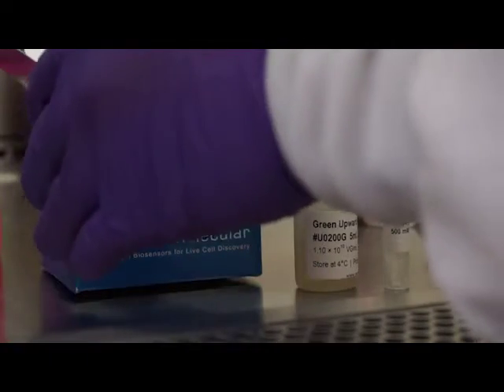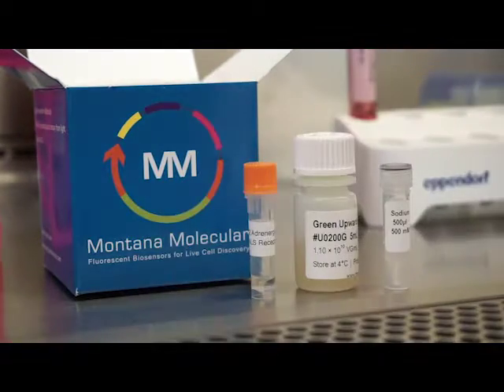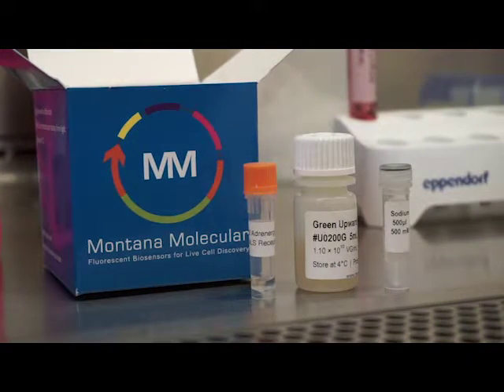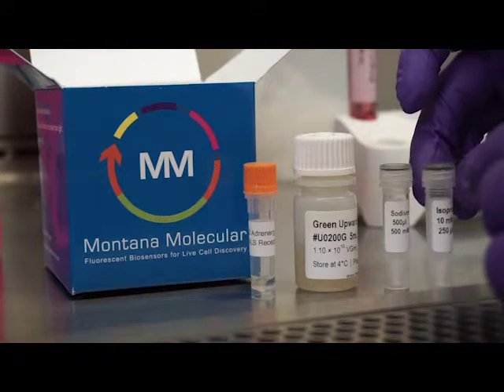The receptor control — in this case the beta-2 adrenergic receptor — can be used to optimize the assay and serve as your positive control. In the CATIS kit, the agonist that activates the receptor control is isoproterenol.